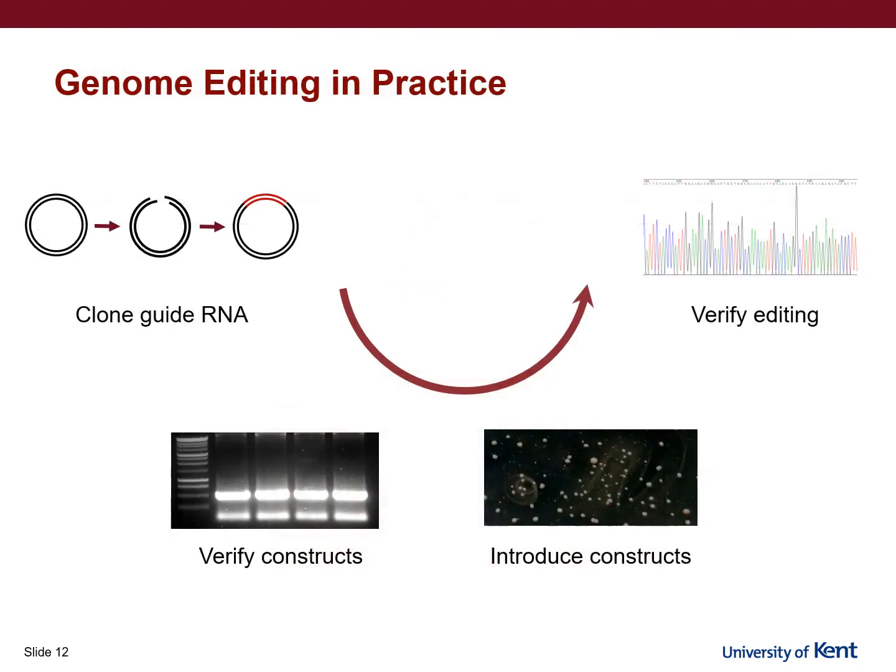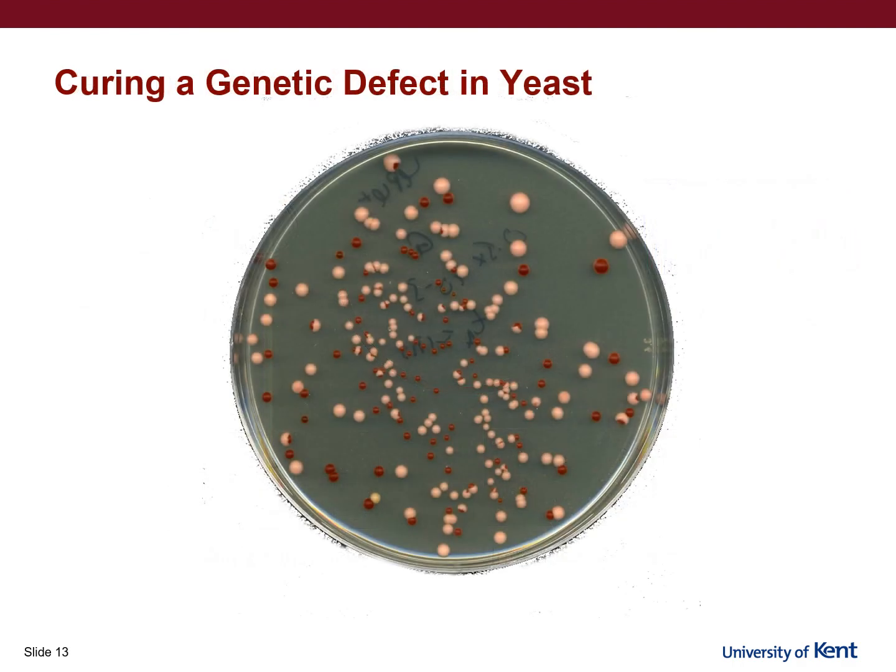Your task in the practical is to remove this deleterious mutation, and in preparation for this work, you will have to design guide RNAs suitable for targeting that ADE2 gene, cloning these guide RNAs into expression vectors that already contain genes for the Cas9 protein, selection of successful cloning products, their introduction into yeast cells, and finally verifying that an editing event actually occurred in the target cells. For 3 successive years now, our students have successfully applied one of the most advanced molecular biology techniques that is still revolutionizing medicine and biotechnology.